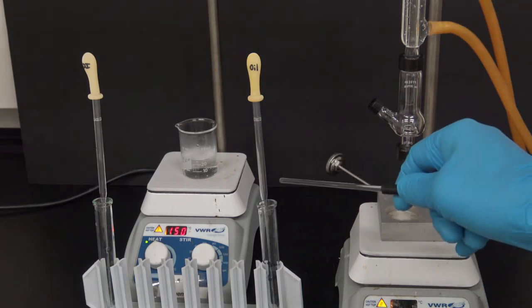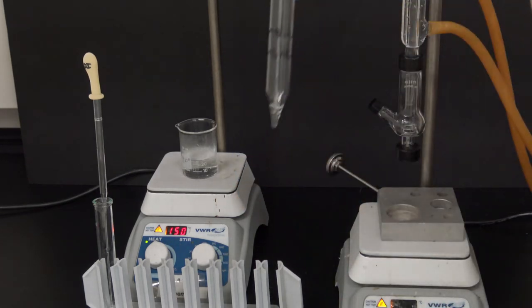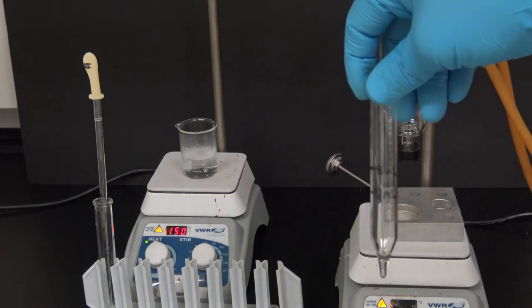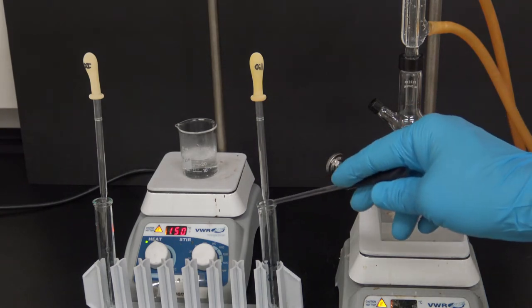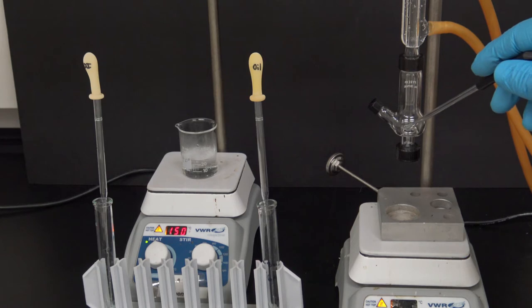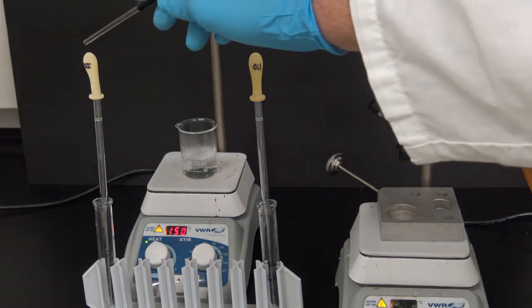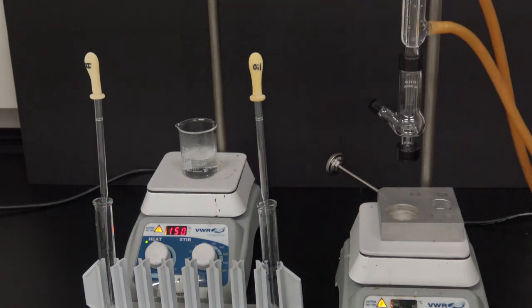I also have here a conical test tube, which I've marked 6 and 8 milliliters on, because I'm going to be removing distillate as it collects in my Hickman still, and I'm going to place it in my test tube. I'm going to use this pasteur pipette to do it, and I've labeled it oil. As I remove liquid as it distills up into the Hickman still, I'm going to replace that water with this pasteur pipette, and therefore I have some water heating here in the back.